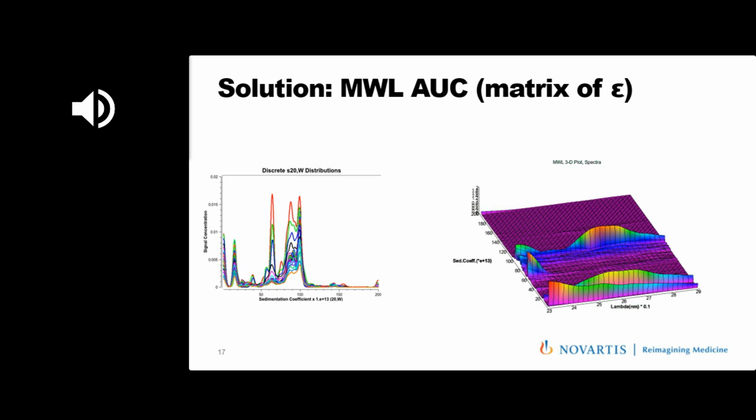And already from looking at the raw data, you may see, okay, here this small contaminant or degradation product on the left-hand side, this may be protein plus DNA. It's steeply decreasing from 230 to 290, so it may be a mixture of quite a lot of things. It's very close to the buffer peak also.